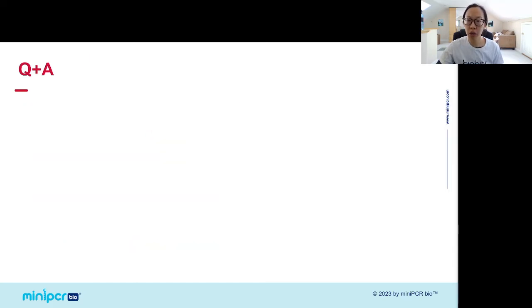A couple of Q&A that were brought up when you guys signed up for the webinar. Some people ask how many students can use one kit. Almost all of our mini PCR bio learning labs, unless specified, have enough reagents for 8 lab groups. So if you put your students in groups of 2 to 4, which is what I recommend, one kit could cover anywhere between 16 to 32 students.